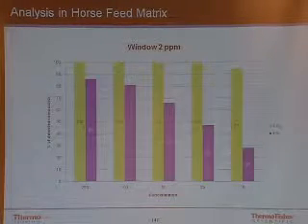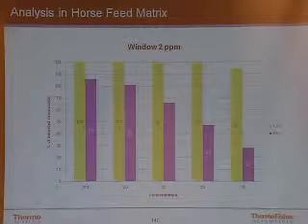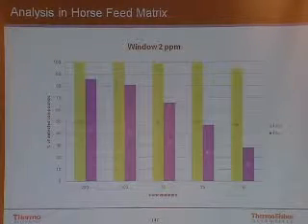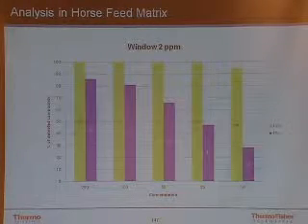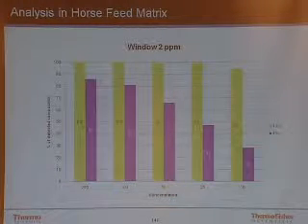And so I think that that is an exciting time because this is a major change in being able to identify non-targeted compounds, because non-targeted compounds are truly, truly unknown, and the only way to really identify them with confirmation is when you know the accurate molecular weight.